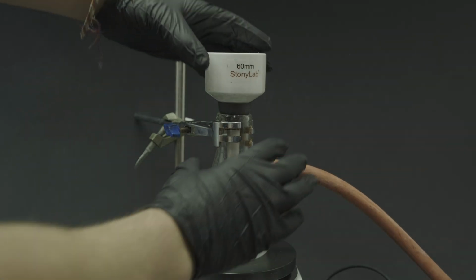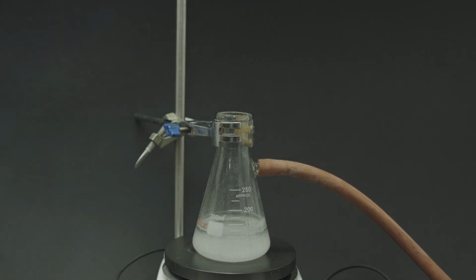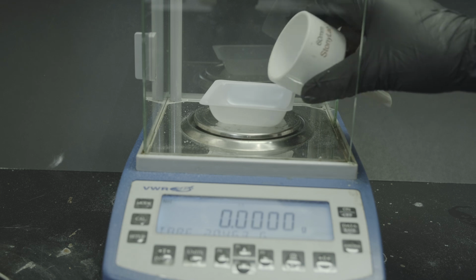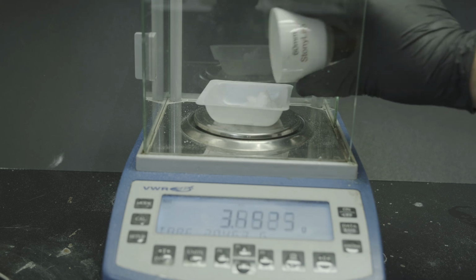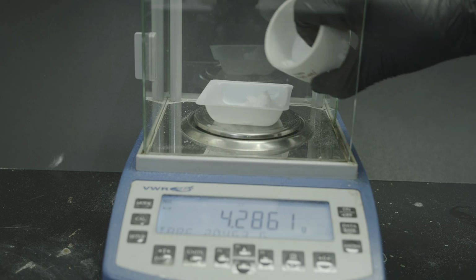Once I had a nice dry powder inside of my filter, I decided to take it off and once again throw it straight onto the scale. I dumped it on, and I got a pretty decent yield this time, around over 4 grams once again. But I knew that I couldn't get my hopes up because last time I'd also got a very similar yield, but it turns out that I hadn't really even done anything.